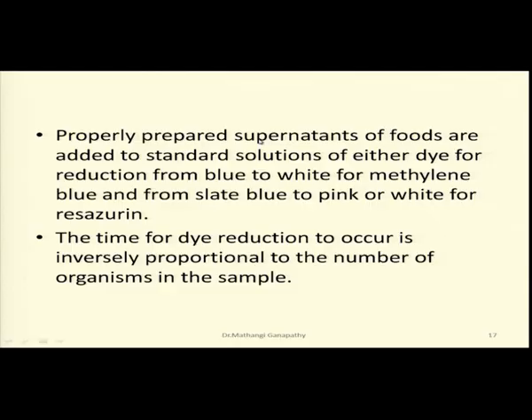Properly prepared supernatants of foods are added to standard solutions of either dye for reduction from blue to white for methylene blue and from slate blue to pink or white for resazurin. So, we take out the sample, a swab or a wash out from this food sample, and this is added straight to the dye.